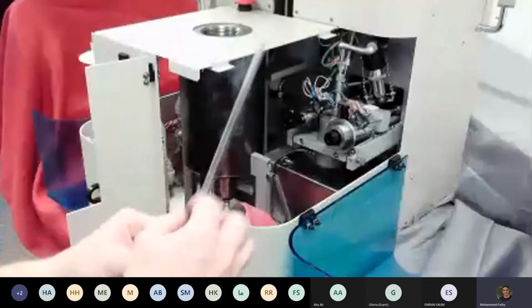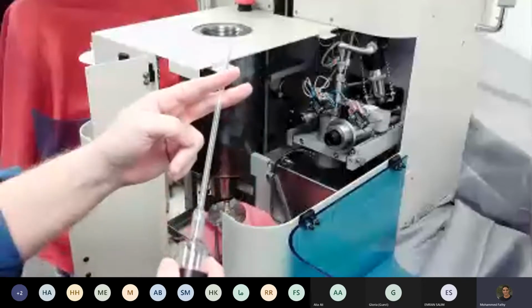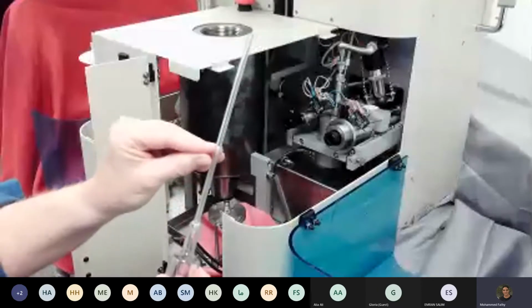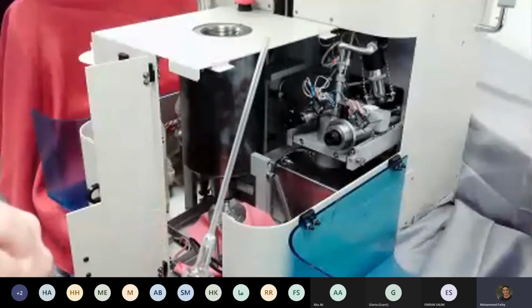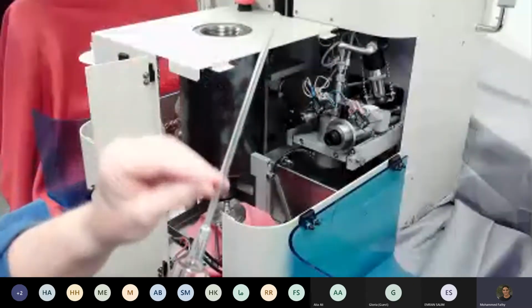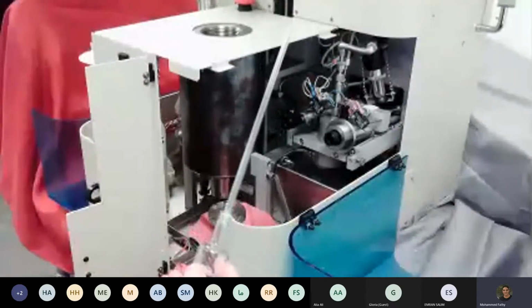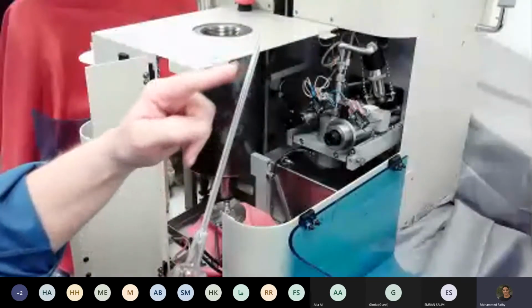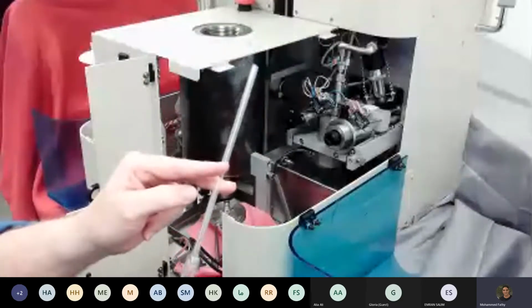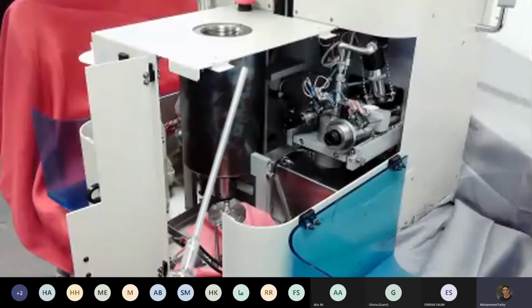Okay, and you'll notice that this is a completely glass sample cell, so you can inspect how clean this is. If there are any breaks in the mercury column, if the sample wasn't evacuated sufficiently, it is possible to end up with some bubbles in here. Okay, and so you can actually see that and say, oh wow, let me do that again because I've got some bubbles in here. If there's a break in the mercury column in this capillary, then that basically makes the measurement not valid.